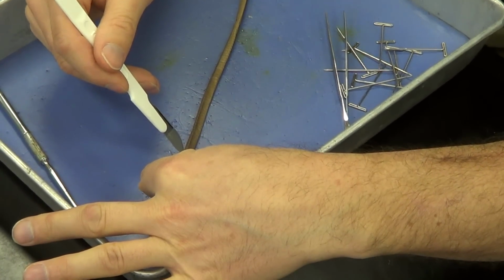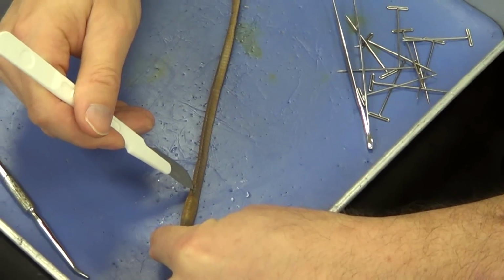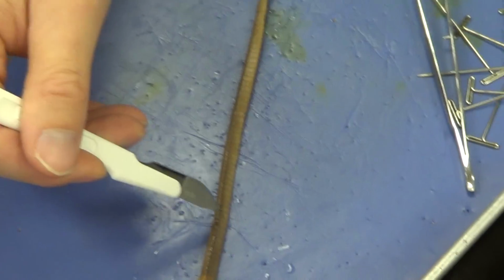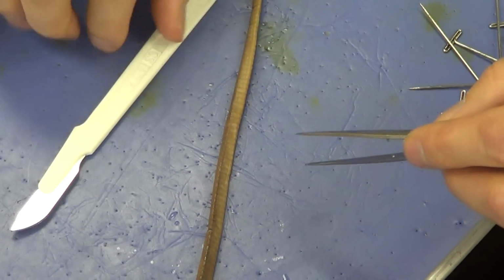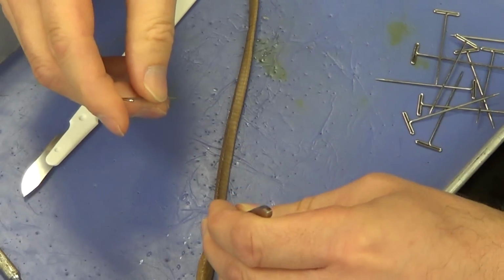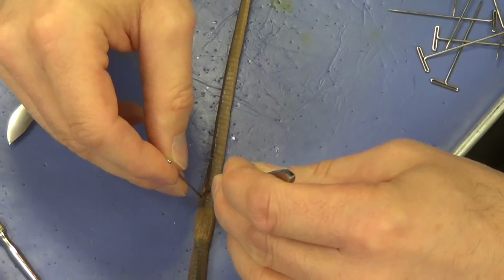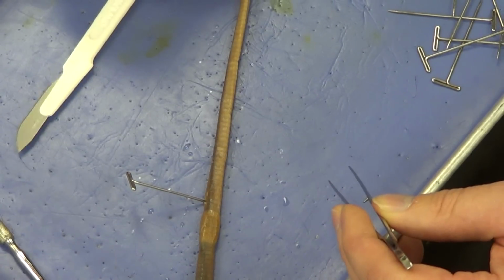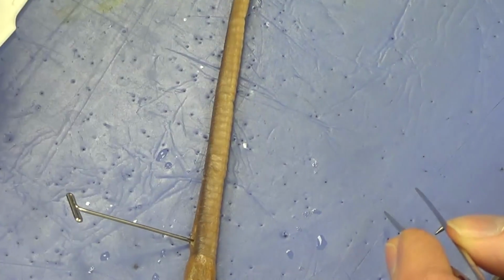And I'm going to start right in the midline. And I'm going to go in very shallow. And I'm only going to cut maybe a half an inch to an inch at a time. Very shallow. And then I'm going to take my forceps and I'm going to try to open that up. That cut I just created, I'm going to try to open it up a little bit. I'm going to pull back the skin. And I'm going to go ahead and I'm going to pin it. So I'm going to put the pins in probably at around 30 degrees or less. And that way I've got some room to not only see, but to work in here.